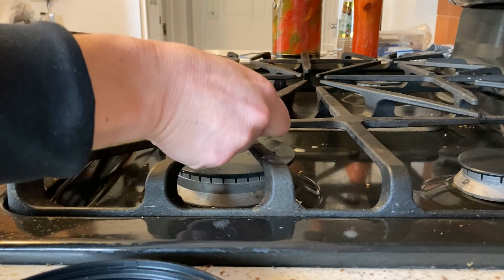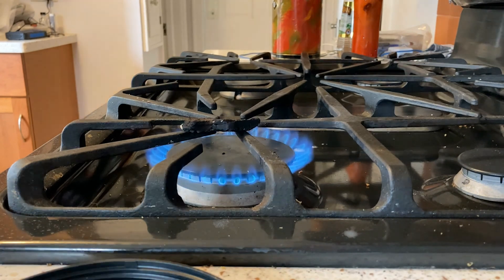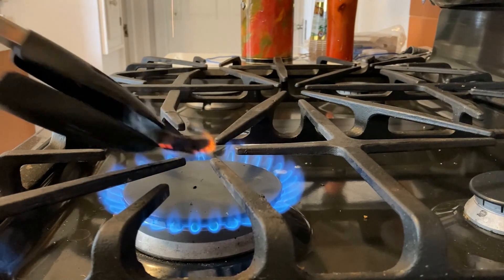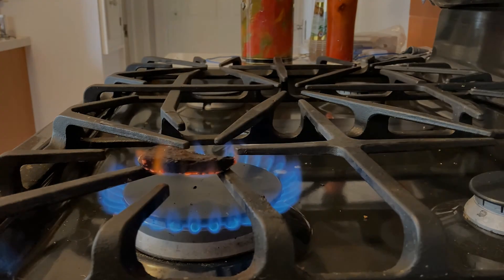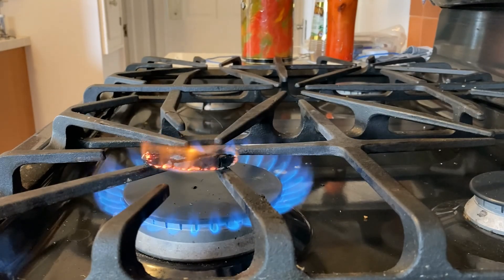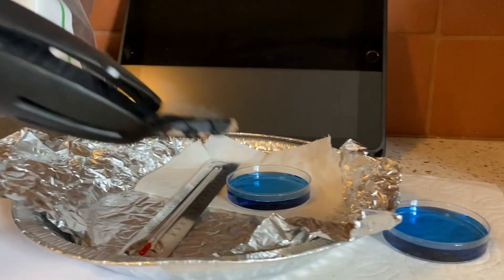We'll start out by trying to light this — it can take a little while. I've got a flame now. When I remove it, it just starts smoldering; it's not really sustaining a flame yet. I'm going to give it a little more time. I've been trying to light it for a little over two minutes now and it still just smolders.